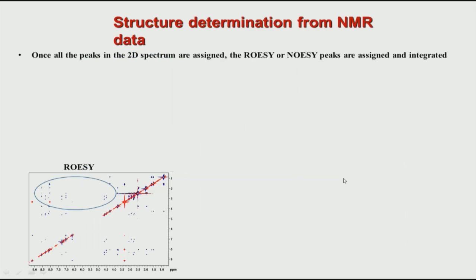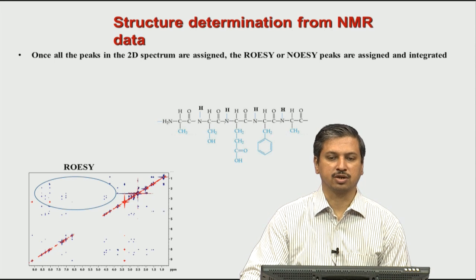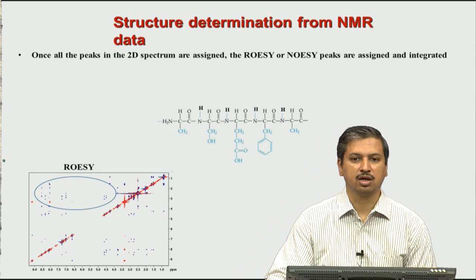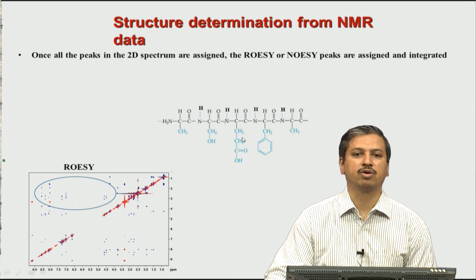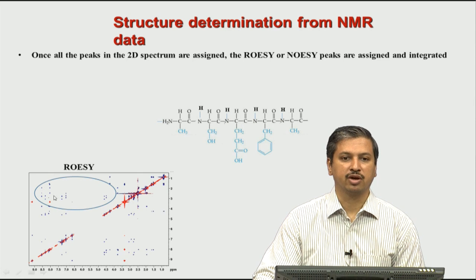So, these are the different pieces of information we can get about secondary structure. Now, what we do next is to find out the tertiary structure. Tertiary structure is basically the final 3-dimensional structure, and for that you need to look at the NOESY spectrum here. In the NOESY spectrum, every peak, or spot, is actually a chemical shift correlation between two atoms.